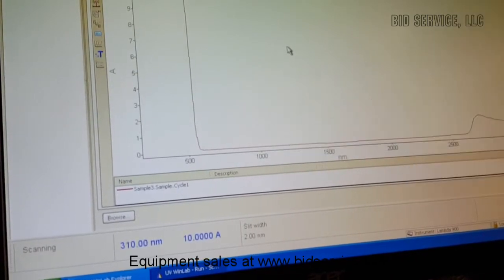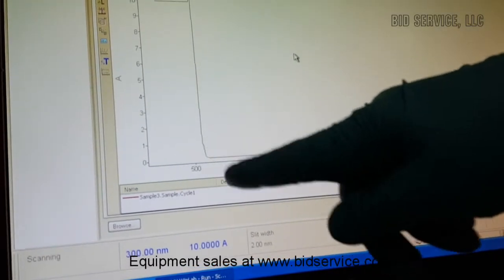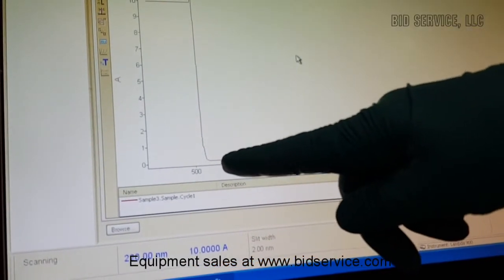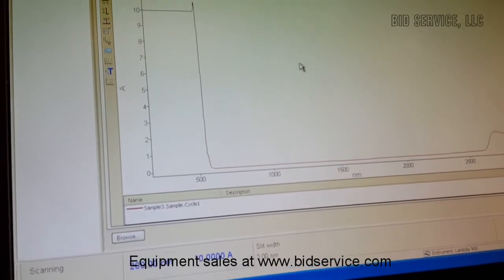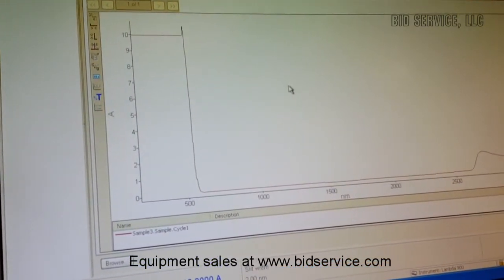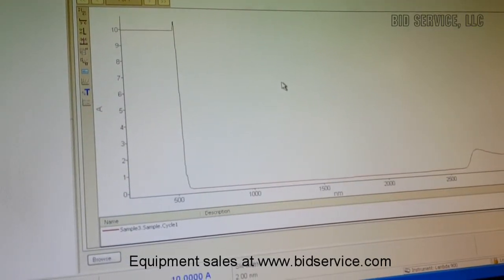So the red color filter I have filters all the lower wavelengths. The absorption is higher, it starts from 550 nanometers. The absorption is very high, so it confirms the properties of the filter I have here. So it transmits all the higher wavelengths above 550 nanometers.